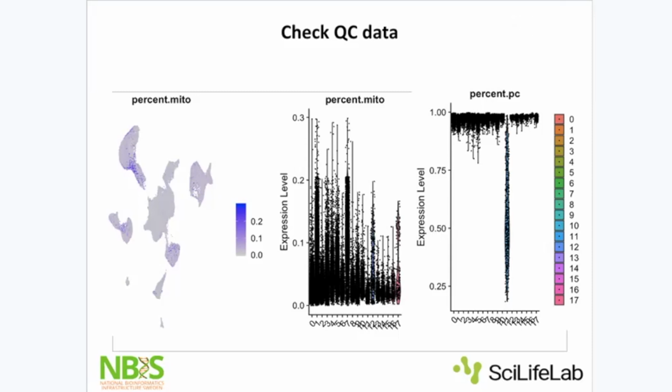But I would say when I run both of them, they're not that different either. You get very similar results, so it probably wouldn't make a huge difference to run either of them. So as long as Seurat is also supporting Louvain, I think you're fine to run that also. It's not that big a deal.